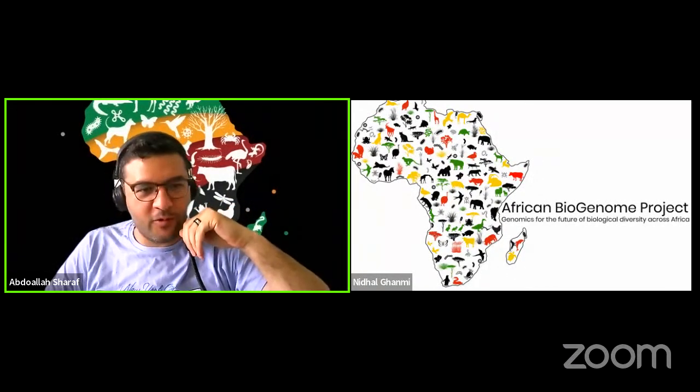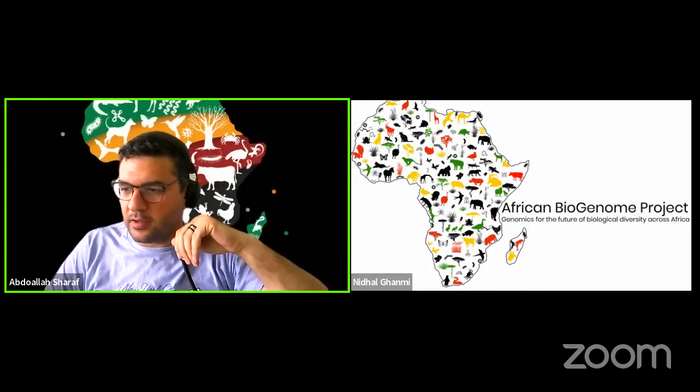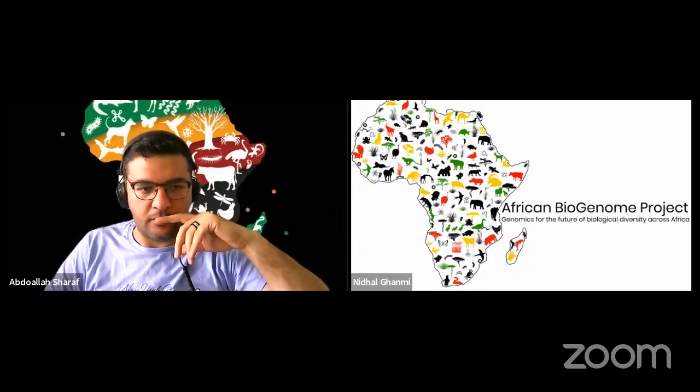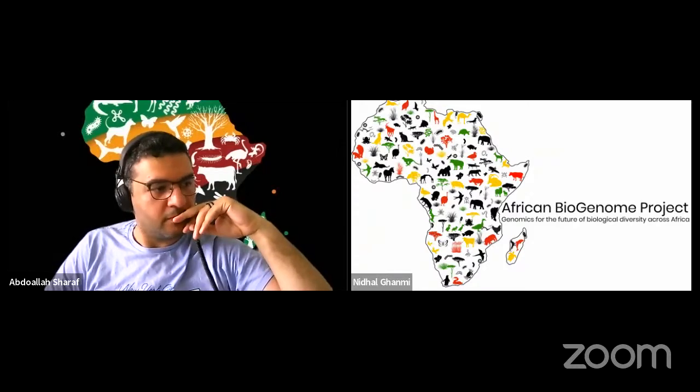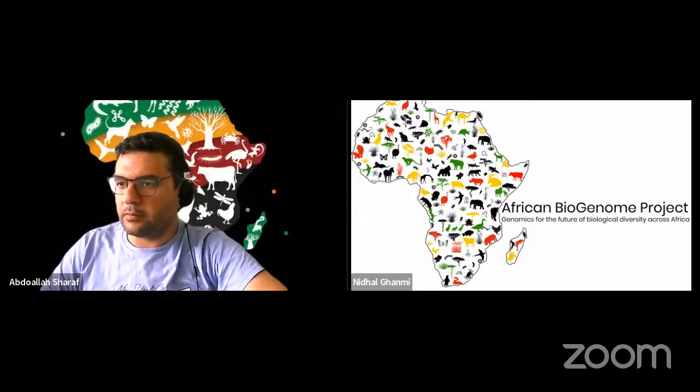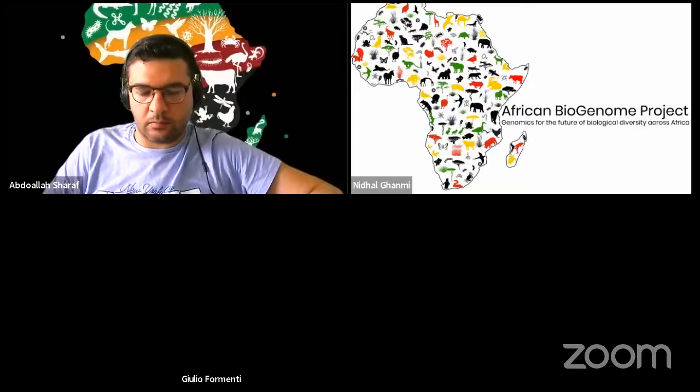So in the time we wait for Giulio to log in, I see Shakwaka still has a raised hand. Do you still have a question to ask? I already asked my question in the chat group, but I can make it a little clearer this time. Is it possible that as Galaxy web development goes on, some tools are lost along the way? Last week I had a variant calling activity. I generated a VCF file using BCFtools call. Then I needed to use BCFtools count to count the variants, but I couldn't find any alternative that could do that. So that's my question. Okay, so maybe Nidhal and we will try to reply to your question in the open discussion session.